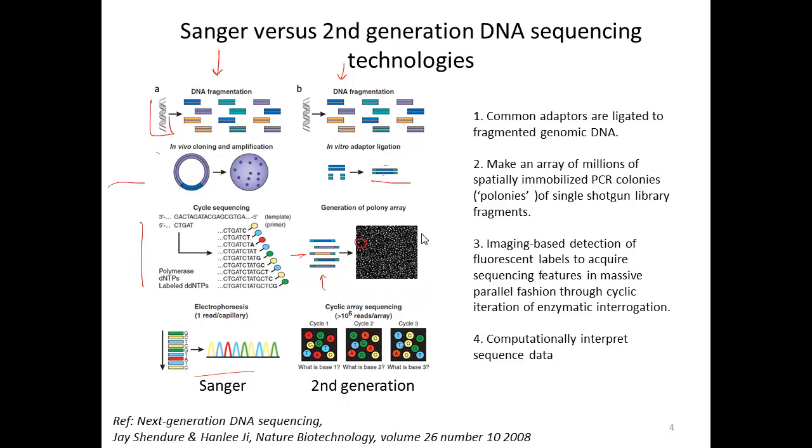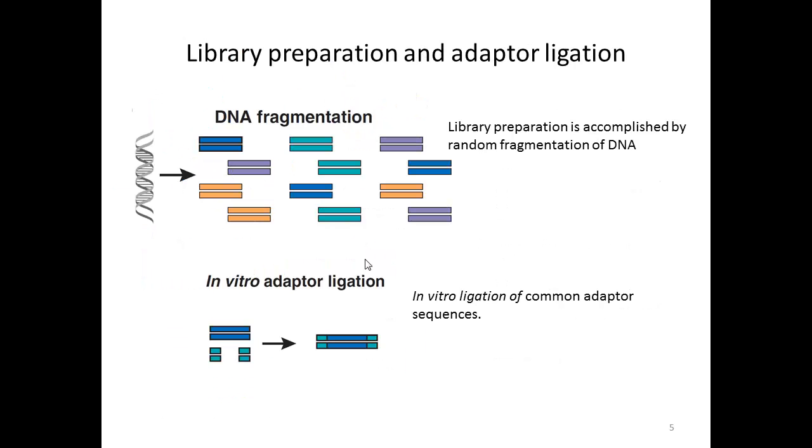We've miniaturized the sequencing reaction by having millions of different sequencing reactions in a single small volume, and they're separated by spatial location, so that even though the reagents are mixing for all these spots, the fluorescence that's incorporated at a particular location can be read independently. Now I'd like to focus first on different mechanisms of DNA amplification, which again is going to be based on ligation of adaptor sequences and then PCR amplification of the double-stranded DNA.